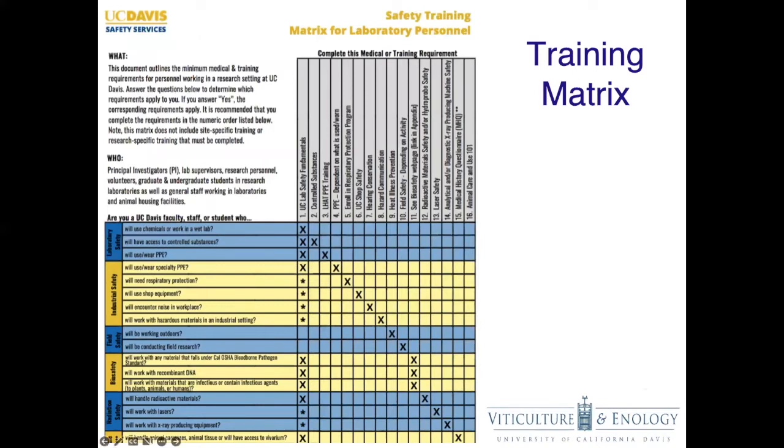Here's an example of the training matrix. These will look different depending on the types of hazards present in the labs you'll be working in. Different hazards may require additional training.